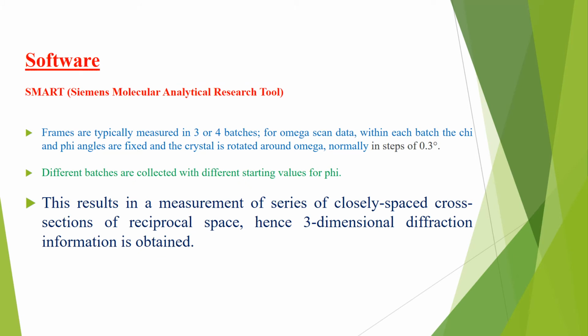We were discussing the softwares that are used in determining the structure of a single crystal in the previous lectures. Here are some other software that are also used, which are related with the single crystal X-ray diffraction machine.